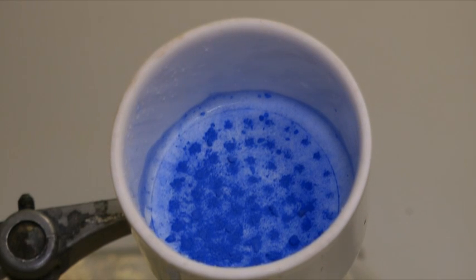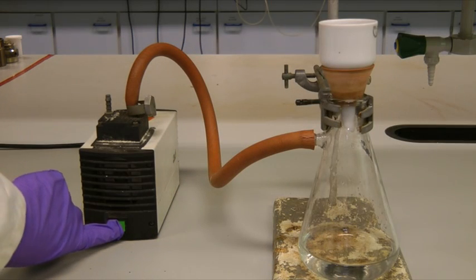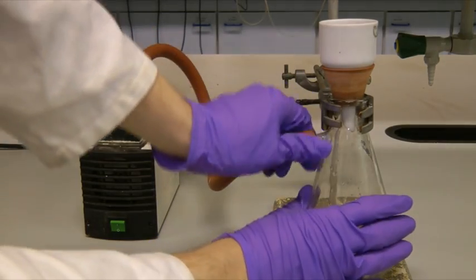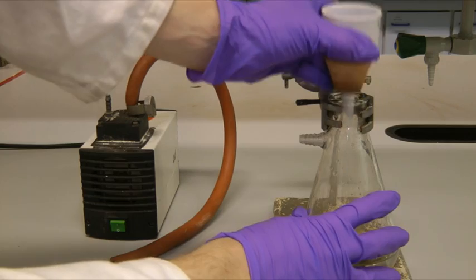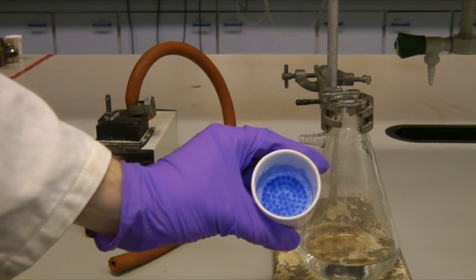Once your product is dry, you can turn the vacuum pump off. You then remove the rubber hose to release the vacuum and the funnel can be removed from the conical flask.